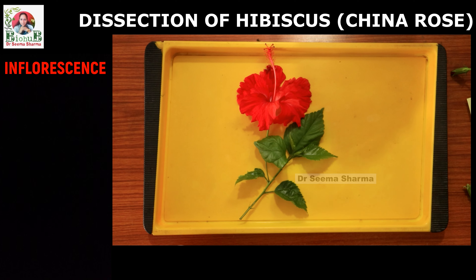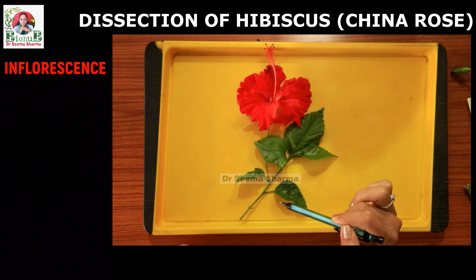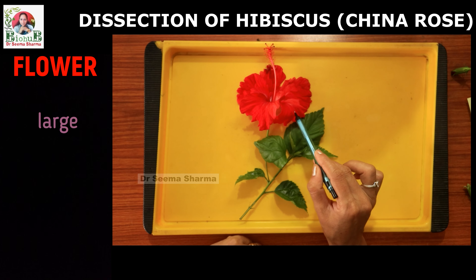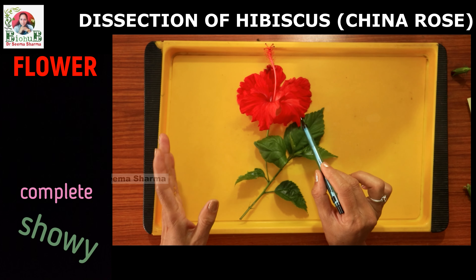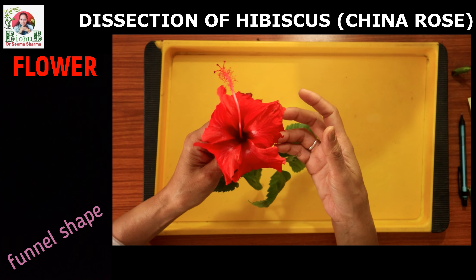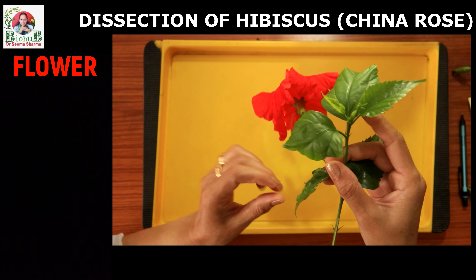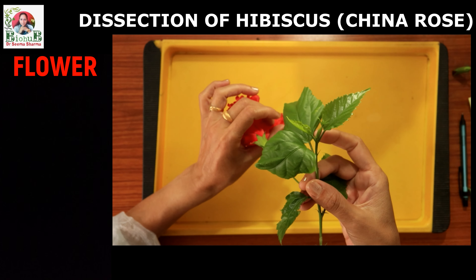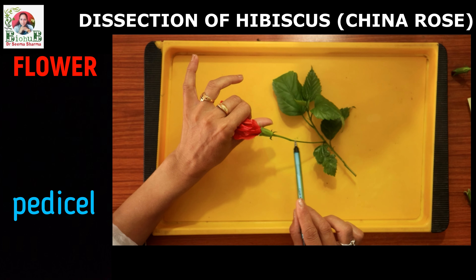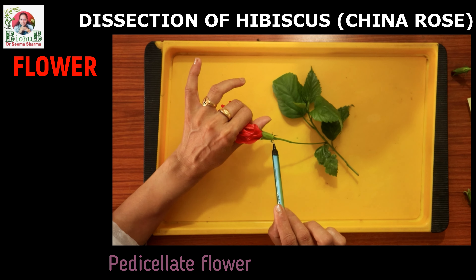The inflorescence of Hibiscus comprises of a solitary bracteate flower arising from the axil of the reproductive shoot. The flower is large, bisexual, complete, showy, and easily recognizable with its funnel-shaped large papery petals and contrasting colorful center. Each flower is attached to the floral branch with the help of a long pedicel, so it is a pedicellate flower.